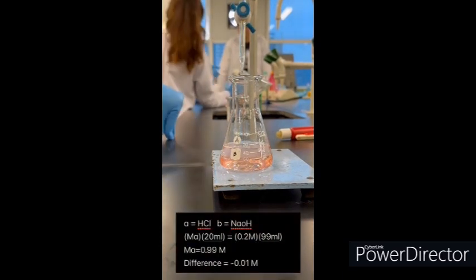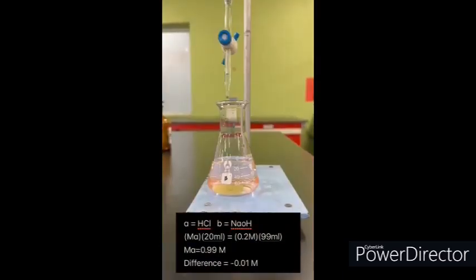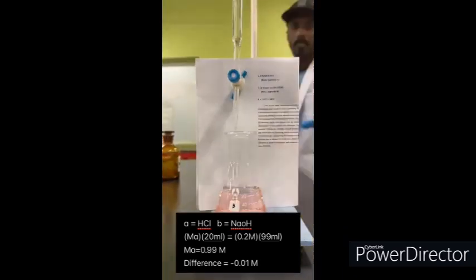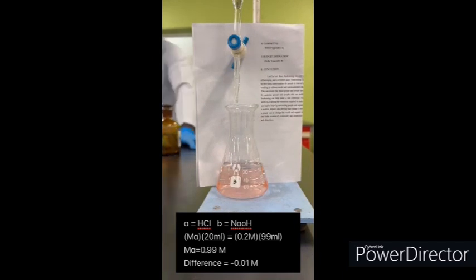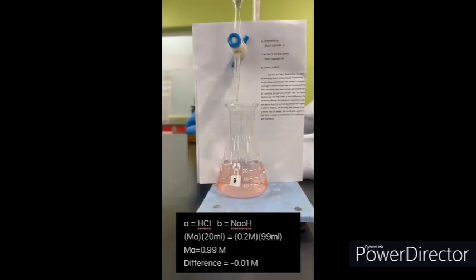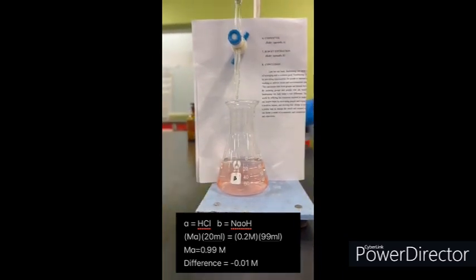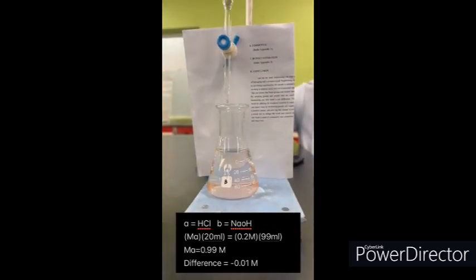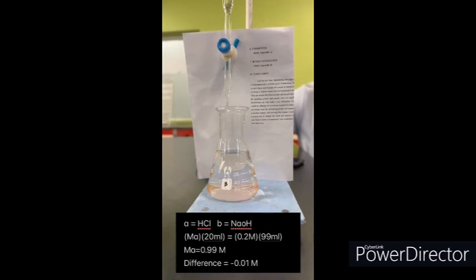Based on the first titration, we use 99 ml of sodium hydroxide to achieve the endpoint, and let's say if the hydrochloric acid molarity is unknown, by calculating through the formula of MAVA = MBVB, the molarity calculated is 0.99 molar for the hydrochloric acid, which is only 0.01 molar less than the supposed result. So the onion extract is quite accurate in detecting the pH of a solution.